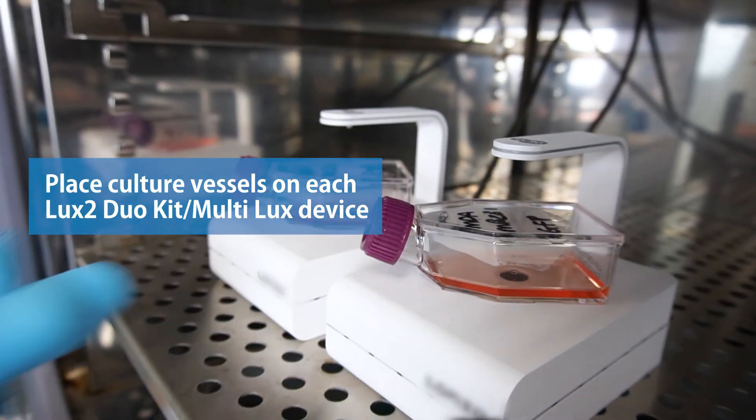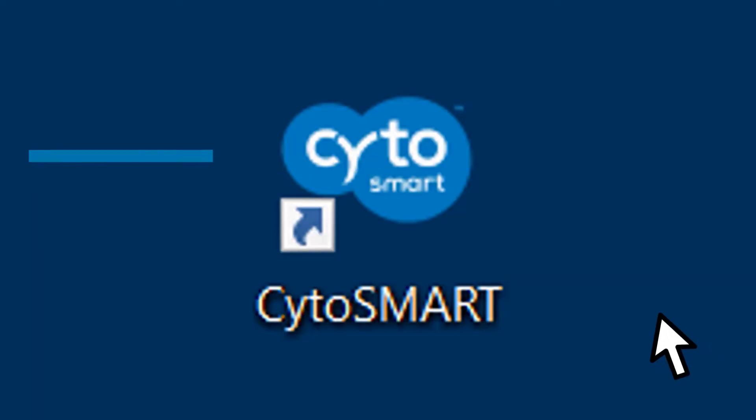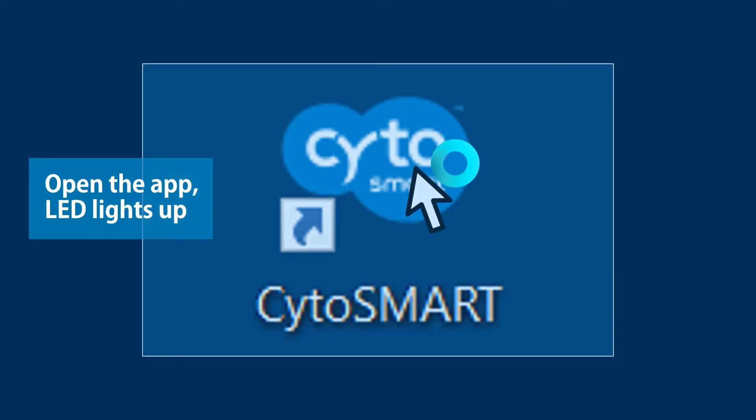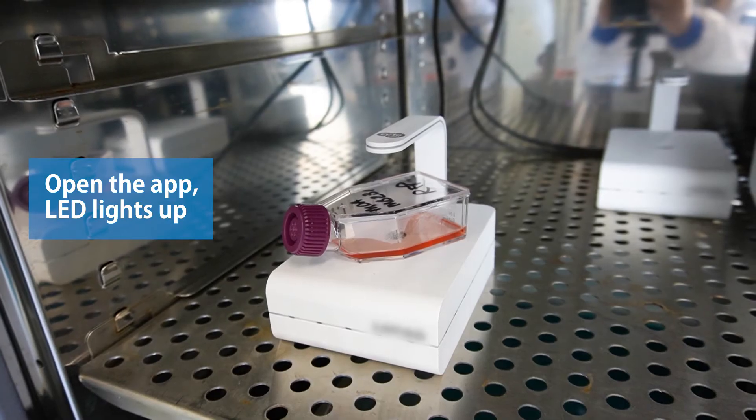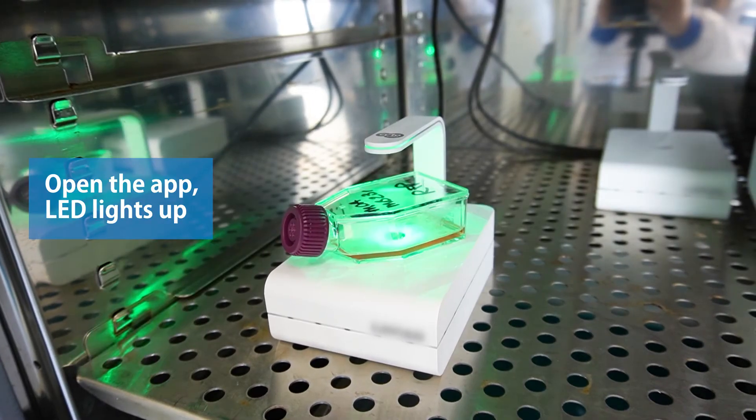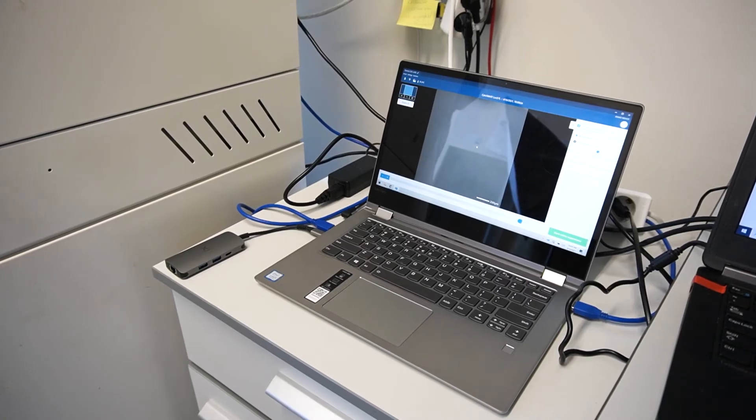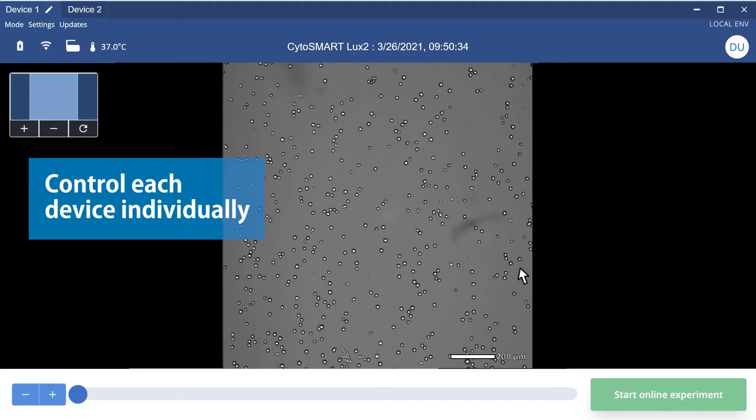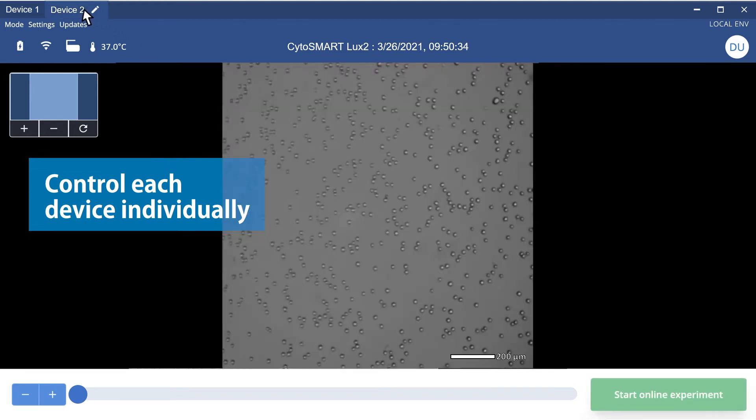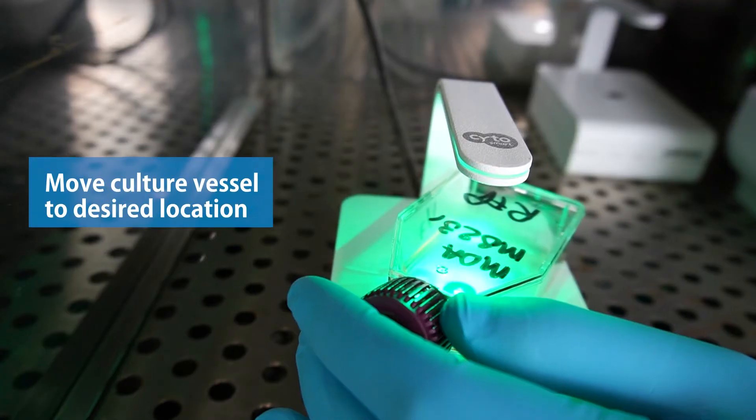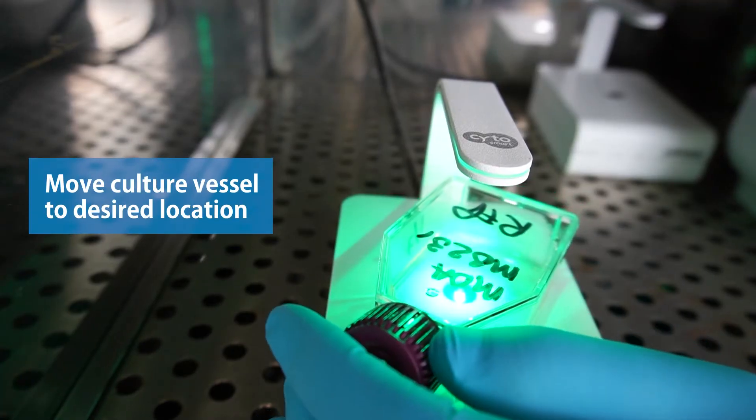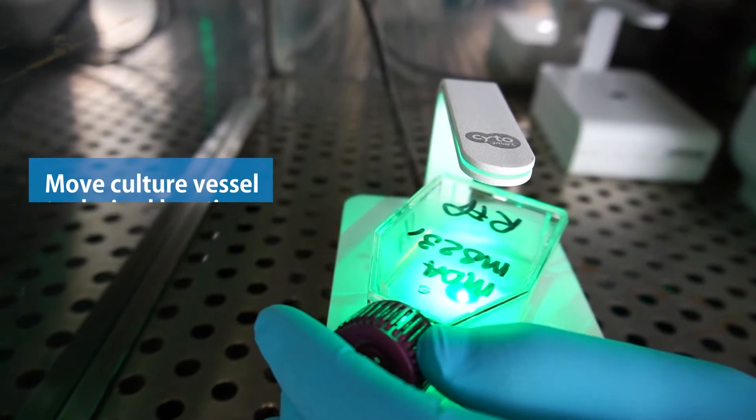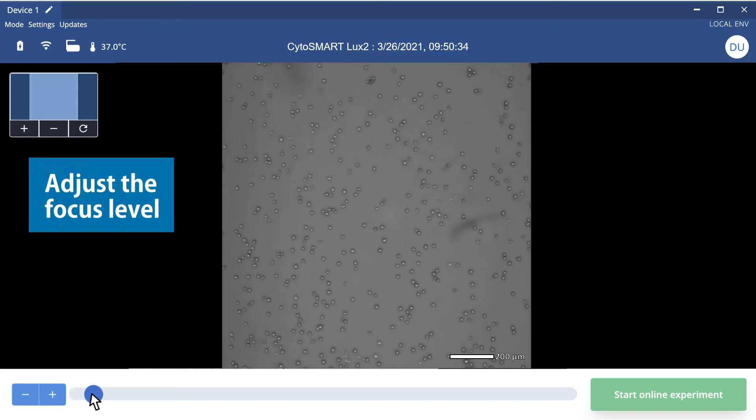Open the Cytosmart app and log in. The green LED of the device will light up and the app will show the live view of your culture. You can easily control each device individually by switching between device tabs in the app. Move your culture vessel to image your desired location and adjust the focus level.